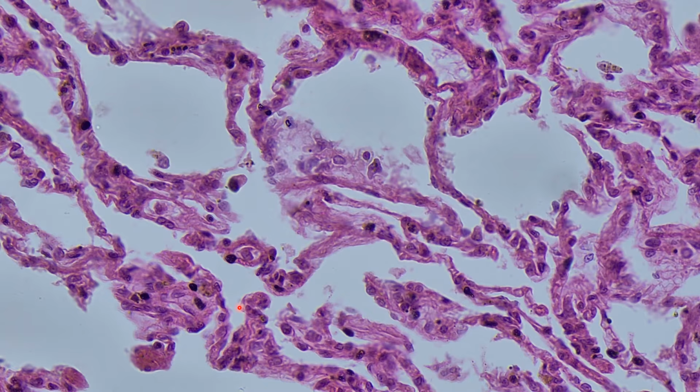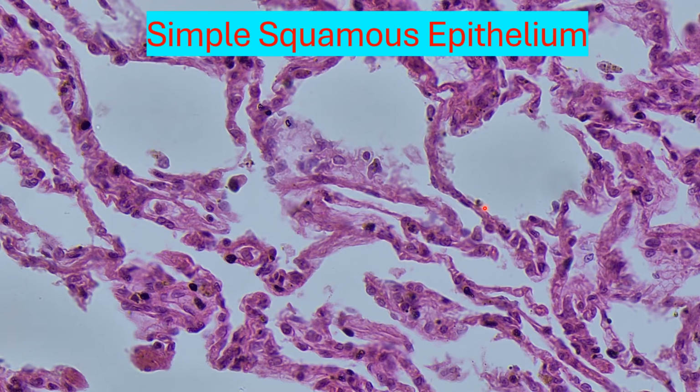Now, this sample right here comes from the lungs. Specifically, we're looking at alveoli or air sacs in the lungs where we have gas exchange. So because of that, we have empty spaces. So we're going to start thinking epithelium of some sort. If we look at overall the shape of these cells, they might be a little hard to discern, but there's a nucleus right there. Overall, here's the cytoplasm. It appears roughly flattened. You might make a case for cube shape, but they really are flat, like right here. Overall, we have simple squamous epithelium.